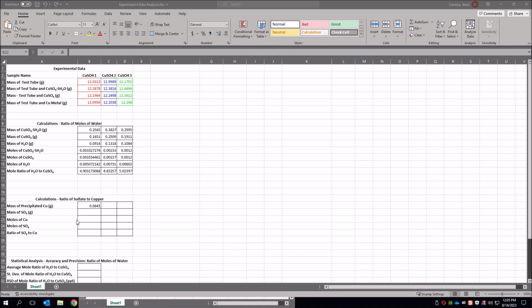So we had solid magnesium, and we had aqueous copper sulfate. We added the magnesium, and then we had aqueous magnesium sulfate and solid copper. We poured off all the magnesium sulfate solution, and we were left with our solid copper. So all that sulfate that was here got poured off, and we were left with just the copper from here. So once again, we find this by difference.